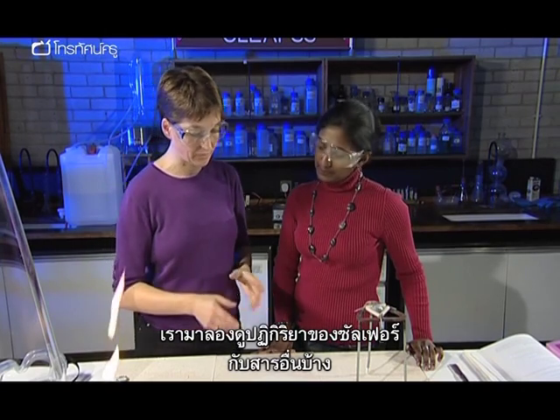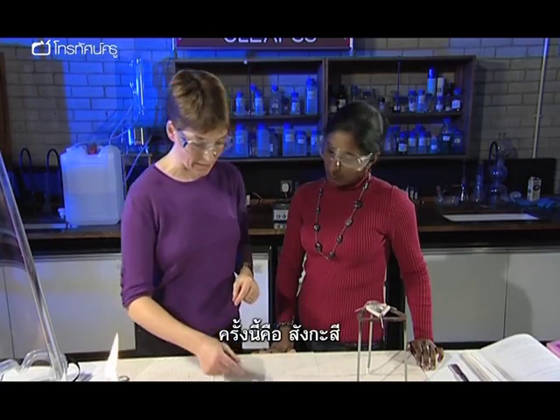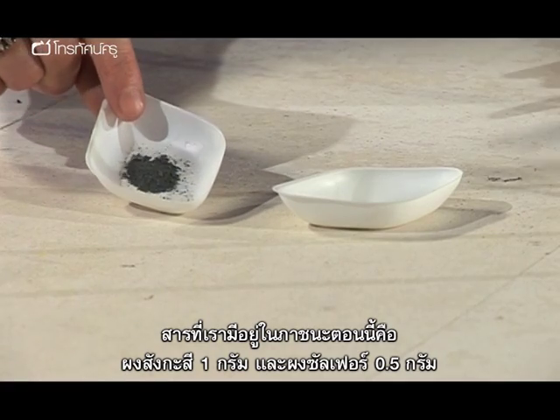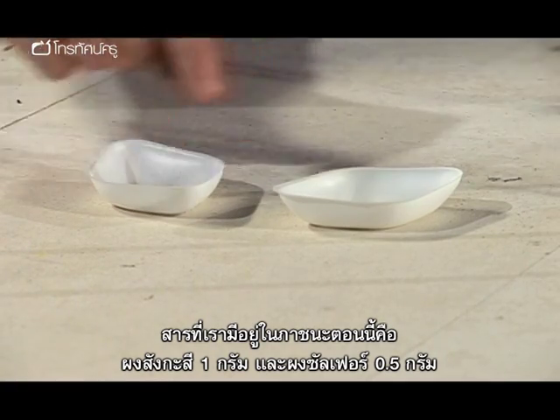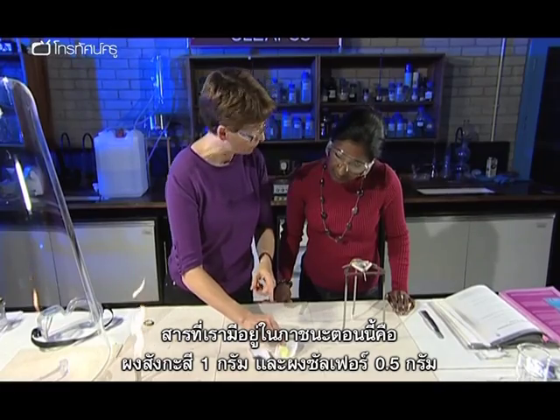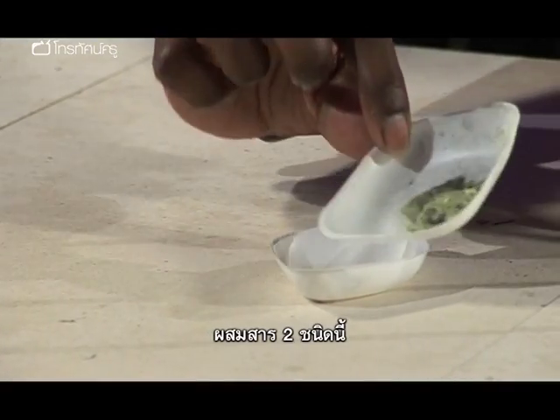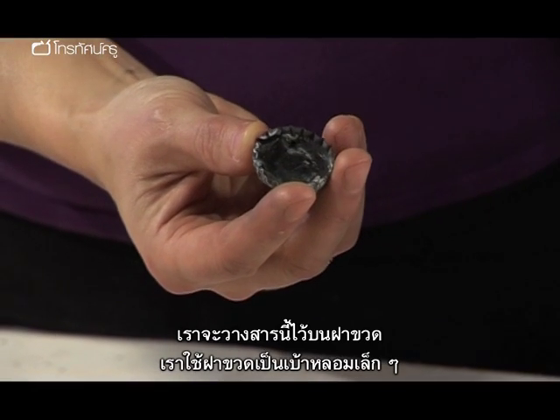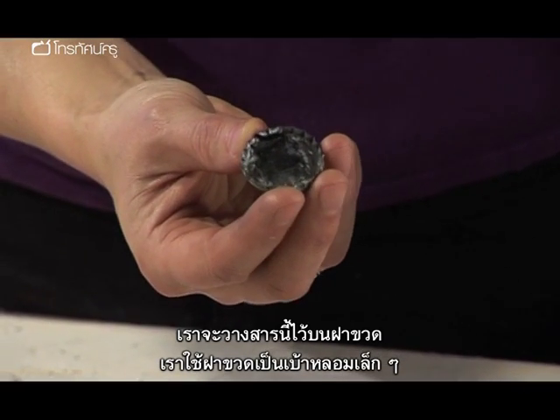Let's have a look at sulfur reacting with another element, this time zinc. What we've got in these two little weighing boats is 1 gram of zinc powder and 0.5 gram of sulfur powder, flowers of sulfur. And what we're going to do is mix them up and then heat them up. And then we're going to put them into a little bottle top.